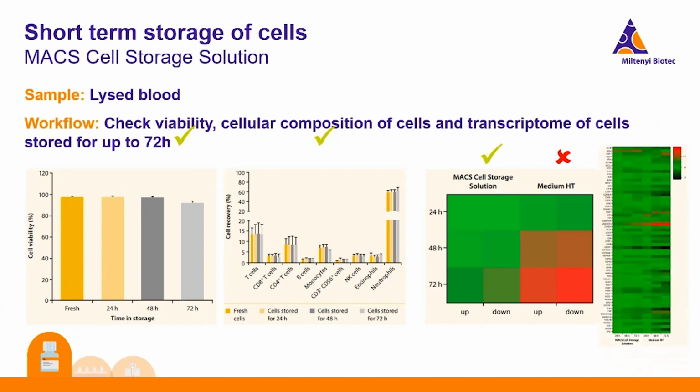And we even had a look at the cellular stress response genes. And we see as well here the same pattern with the MACS cell storage solution. We see a more stable transcriptome in comparison to the medium HT.